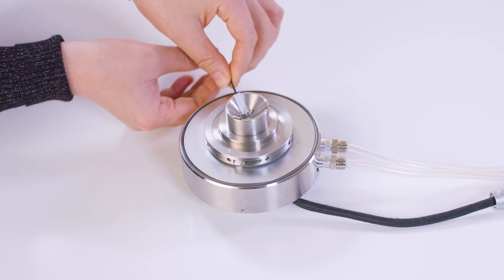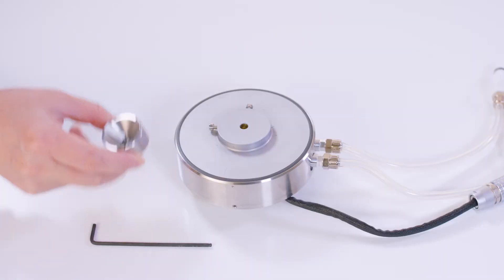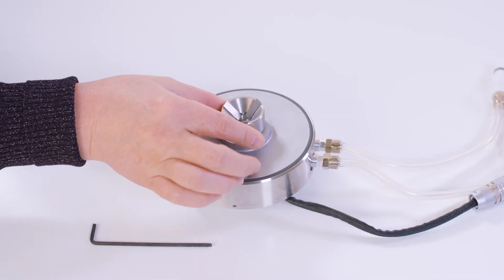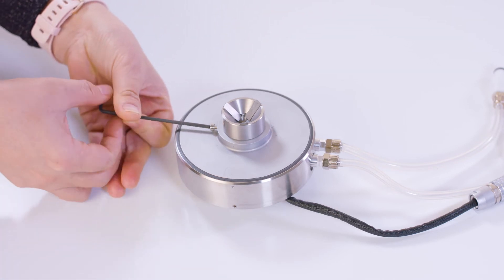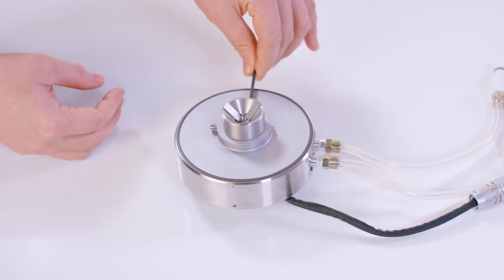For disposable Peltier users, you can directly insert this three-plates lower geometry to the Peltier. After that, install the Peltier to the bottom of the rheometer.